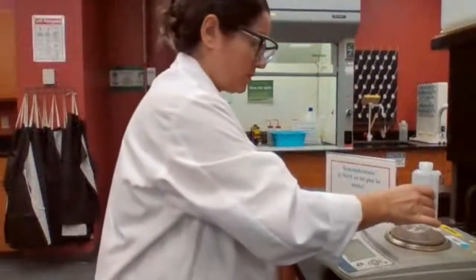Okay, procedure for this experiment. I have to be careful with the steps and the procedure, and also look at the data sheet to see what you actually need to record in your data table, so you can do your calculation and complete your data sheet. First, we need the mass of the empty test tube. We have a balance here.